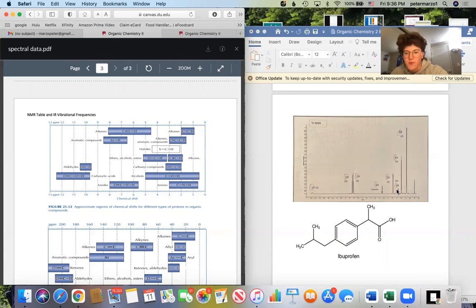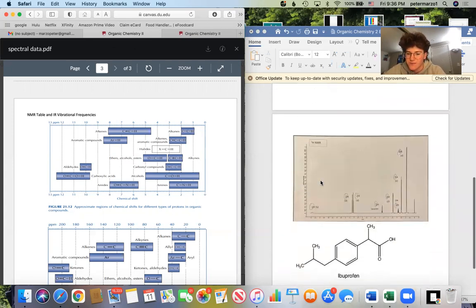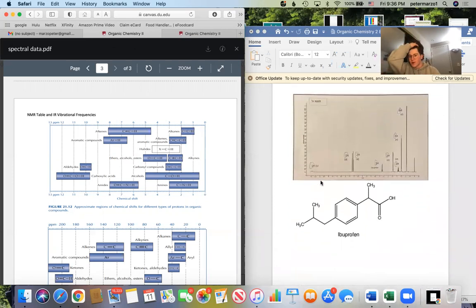This is common in many big molecules, and it is important to notice that this is a larger molecule due to the number of signals that we see on the proton NMR, as well as the integration, showing us that there's 18 hydrogens, which is much higher than ethanol, which shows us only 6. So this multiplet shows us that there's a lot of hydrogens in this molecule, and this is a much bigger molecule than we've dealt with before.